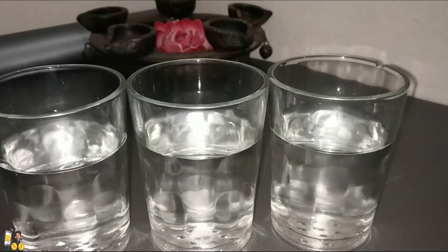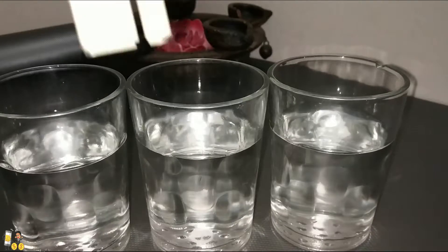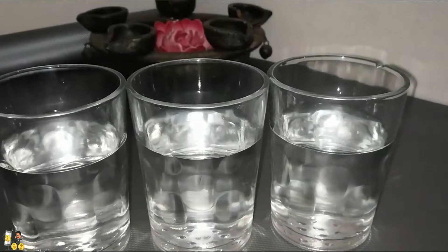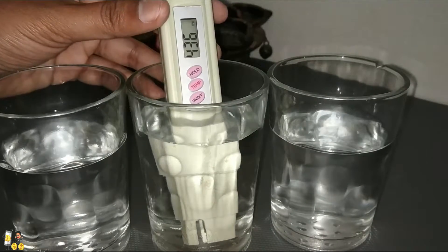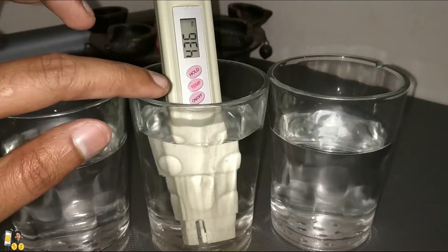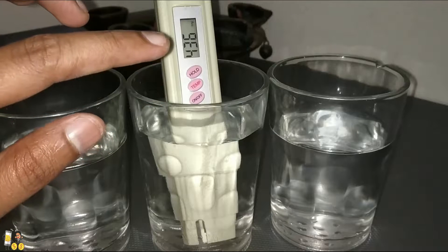We clean it up before the next test. Now we have cleaned it and we are going to place it in the bore water. Previously the tank water was 441 PPM, and now you can see the bore water level is 436 PPM.